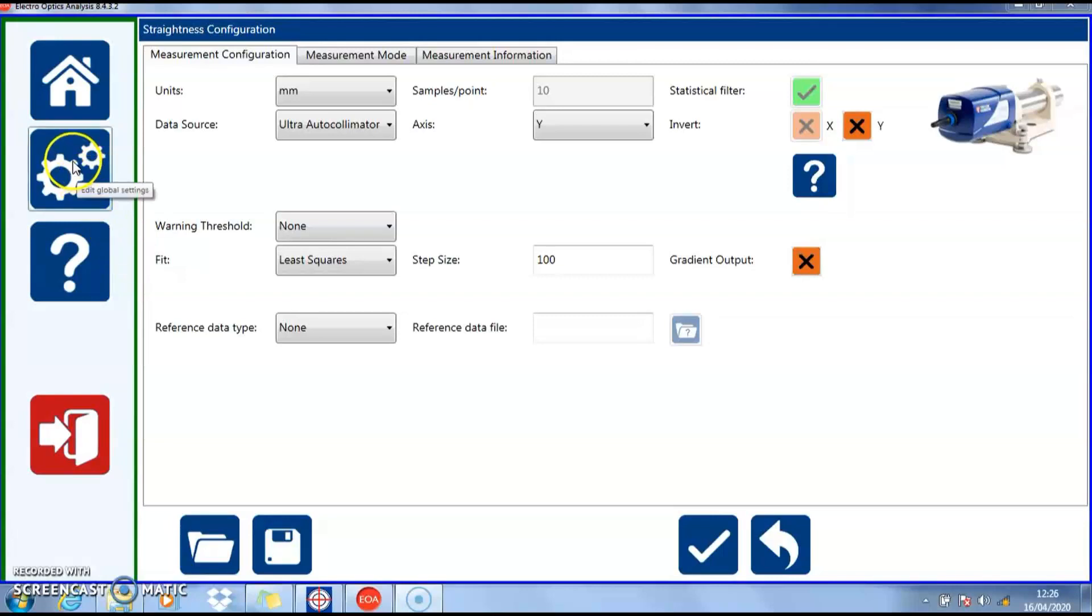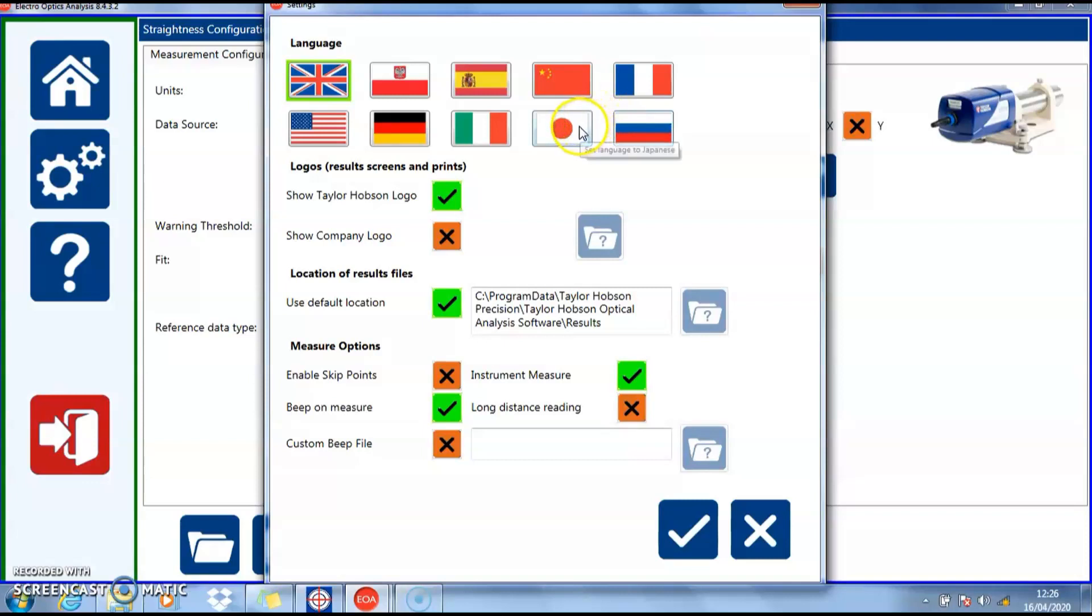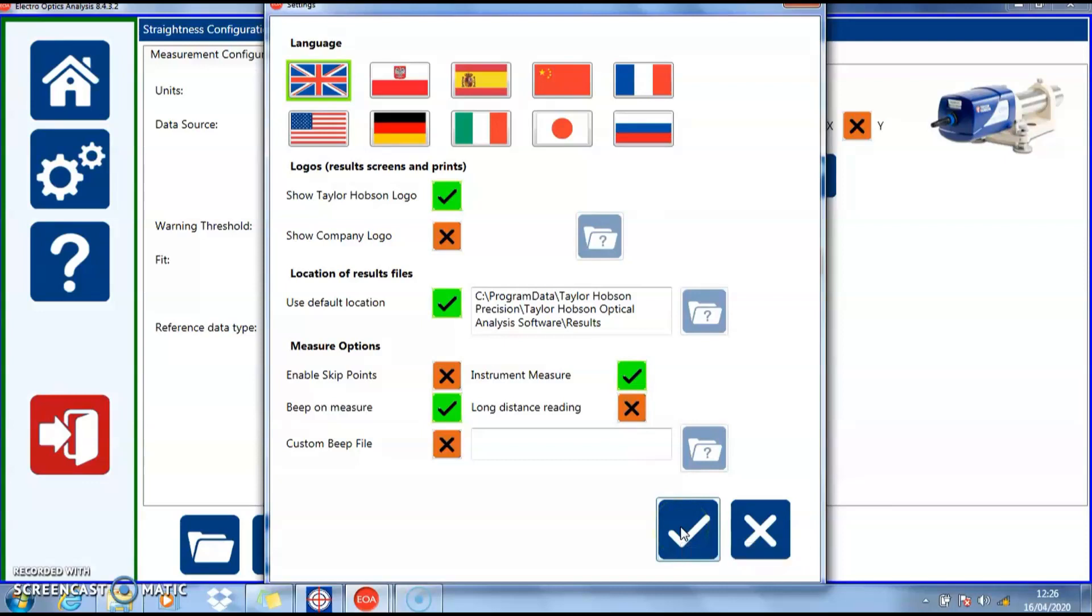This icon is the global settings icon where we can choose the language of the text throughout the program. As soon as you've chosen the language you require, it will only become active when the accept tick is selected, and then you can change back to the local language.